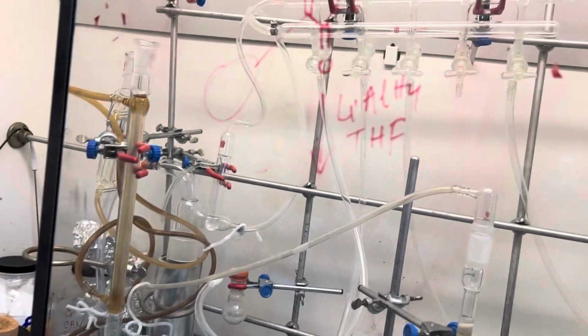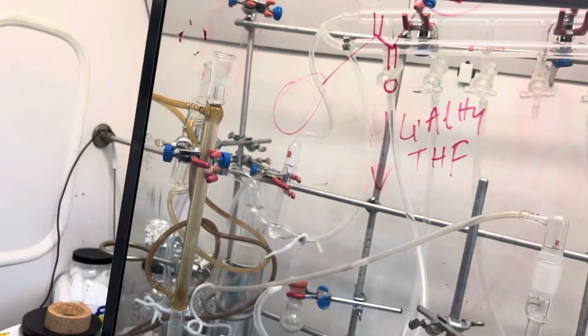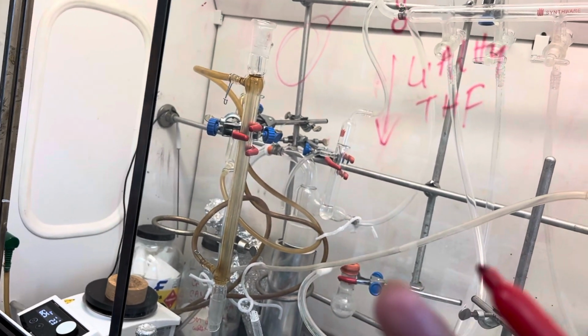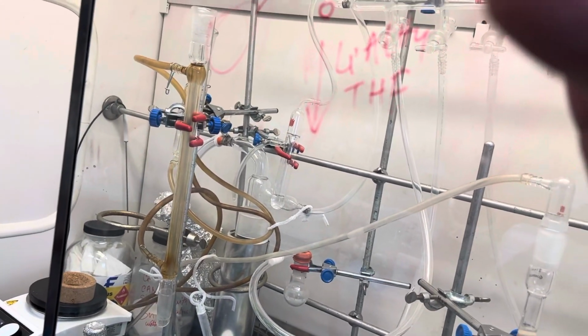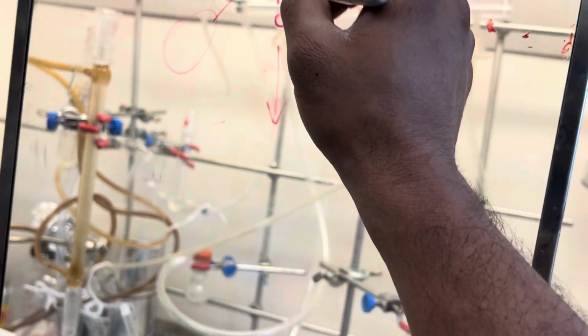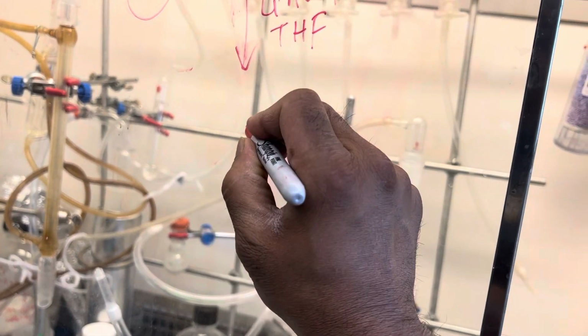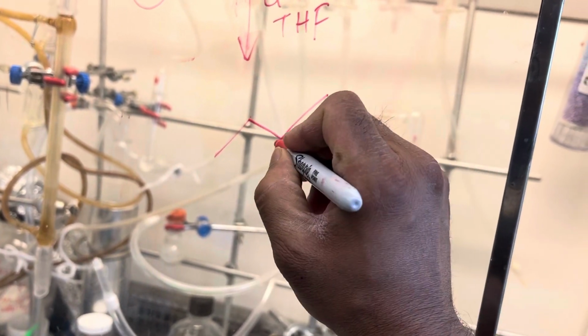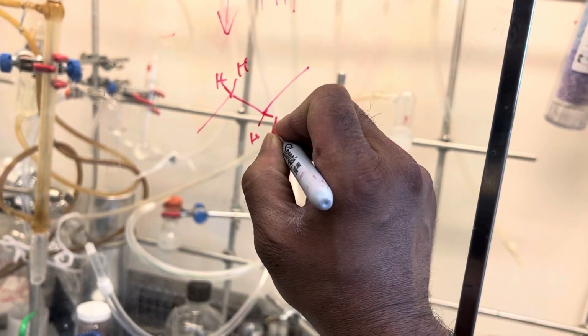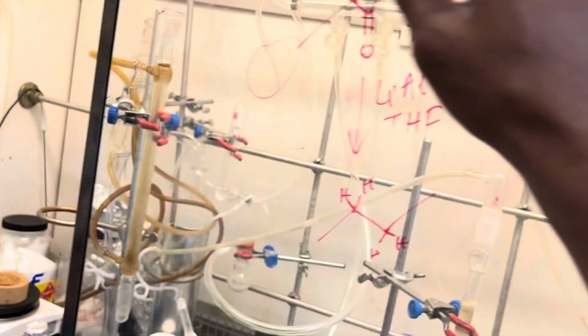So first of all, every time you do any reaction with the crude, there will always be some signature peak in the proton or carbon NMR. So look at the structure and find the signature peak. If the reduction happened, you will definitely get two new CH2 peaks in the proton.